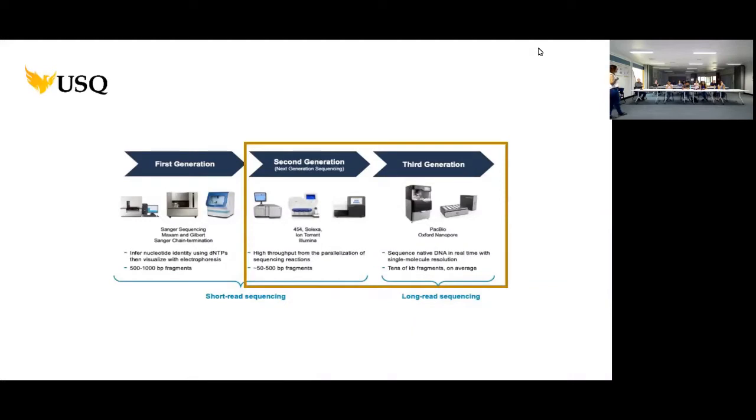We have both of these here up in Dbook: Illumina MiSeq and Oxford Nanopore minION, and they work really nicely together. One is based on short read sequencing, the other is based on long read sequencing. So it's really nice to use them together, and you can use them for a hybrid assembly. You can use them for assembly to try and polish off your long reads. So it's nice to have both of these platforms up in Dbook to use together.